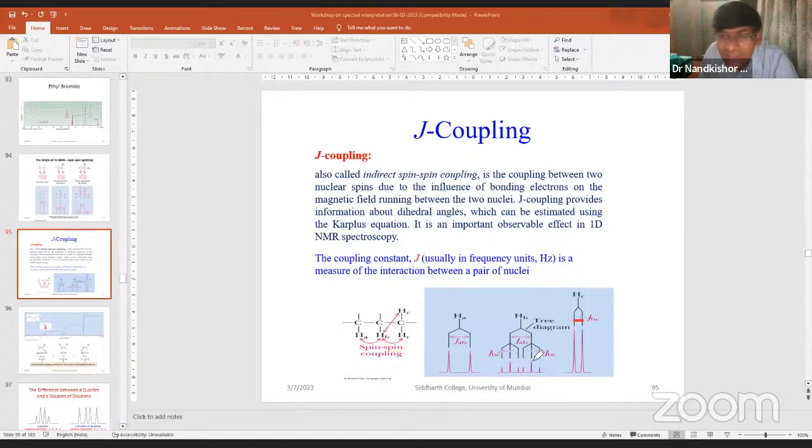Look, this distance and this distance are the same. Now, if I experimentally show you that this J value is 6, then this value will be again 6. And suppose this is 3, then it will be 3 hertz. So what exactly information are you getting from this coupling constant?